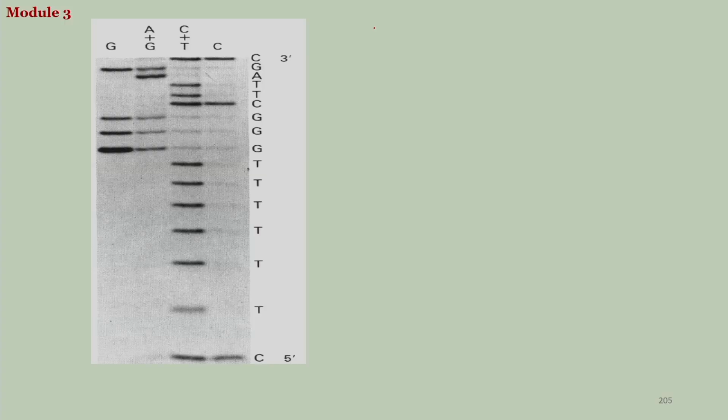Forget about this now. So, we had the sequence, please do not consider this one for the time being, which was 5 prime phosphate, and we had the sequence which was G. Now I do not have to write this because we have already seen how this is cleaved off.